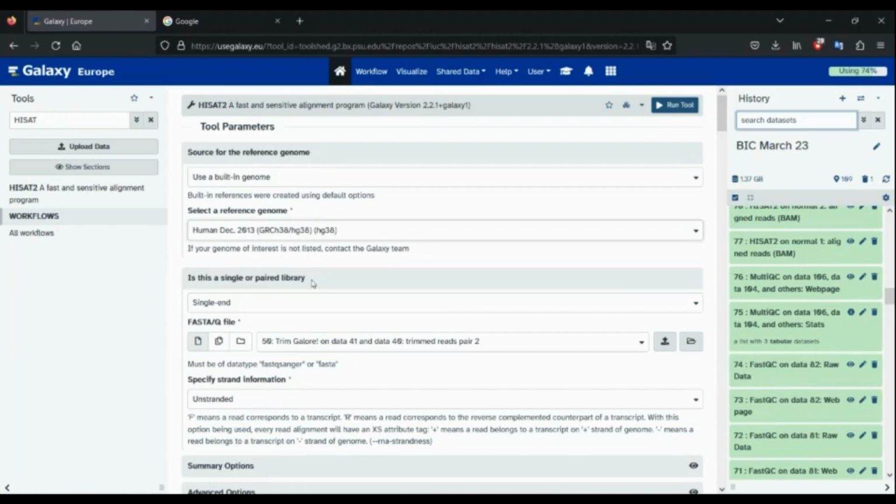All right. Now, the reason why we're using HG38 is because this is the latest version of the primary human genome assembly. This is the official version that is being used by the UCSC Genome Browser, and the UCSC Genome Browser is a standard. It has the standard which we can use as a reference when we're trying to find any sort of genes, any sort of introns, exons. All the information is given in this browser. So this is what we'll be selecting.